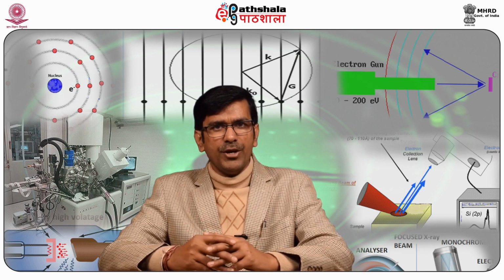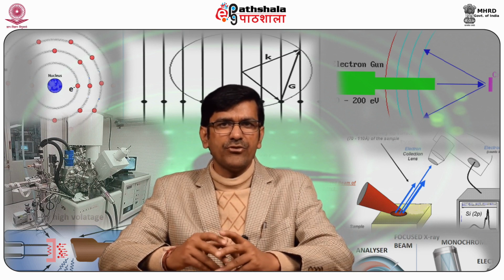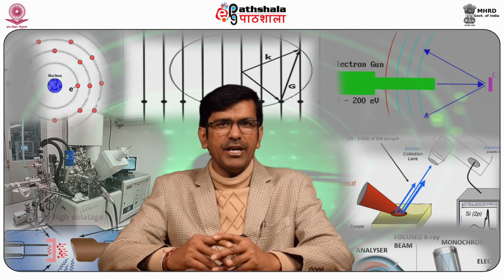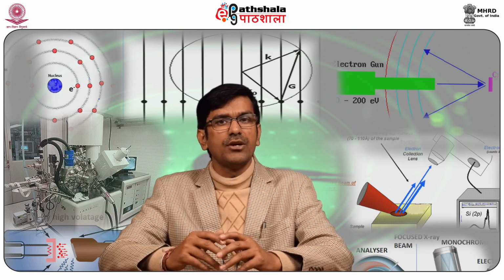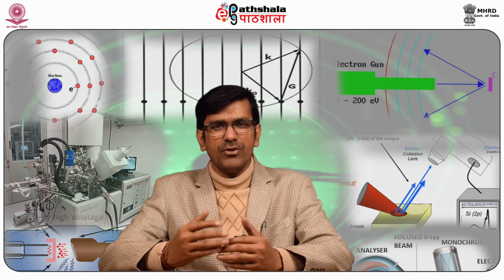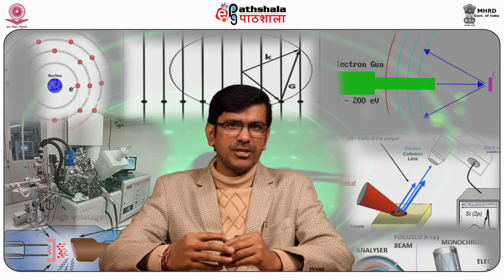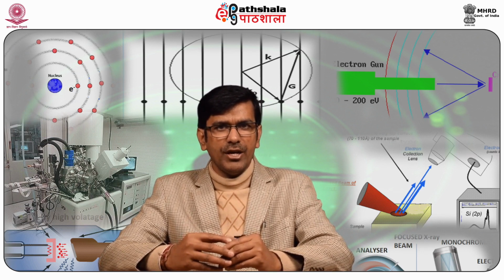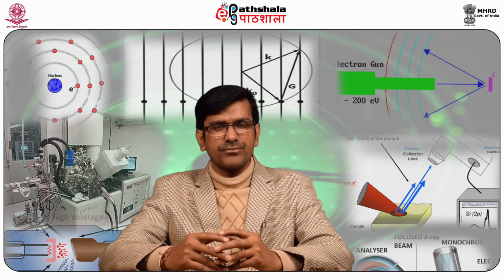One resolution improving technique that affects the sensitivity is changing the width of the entrance and or the exit slits. For example, in an SDA, these slits define the range of trajectories of photoelectrons that enter or exit the analyzer. Decreasing the width will certainly cause the resolution to go up, but the smaller slit size will decrease the number of photoelectrons allowed in and out of the analyzer, therefore lowering the sensitivity.